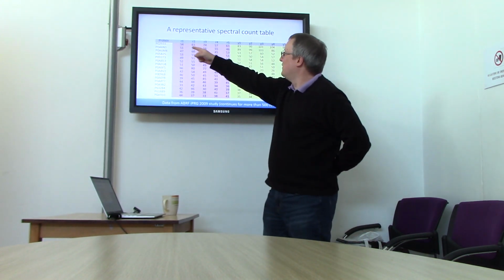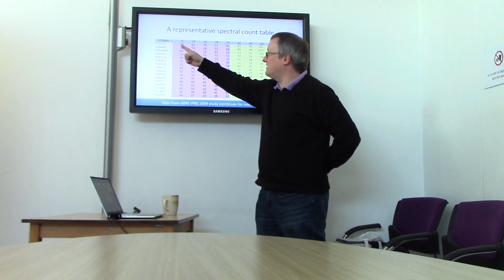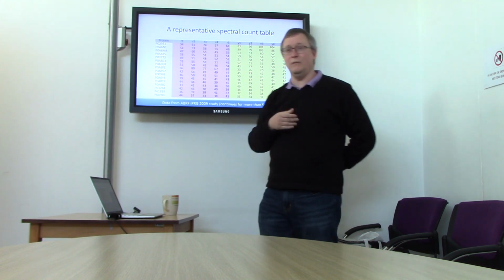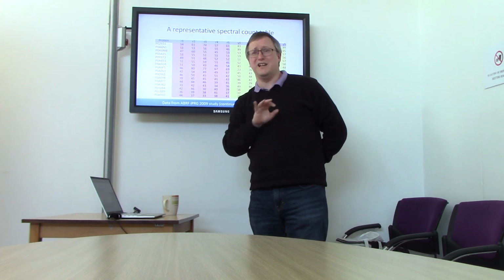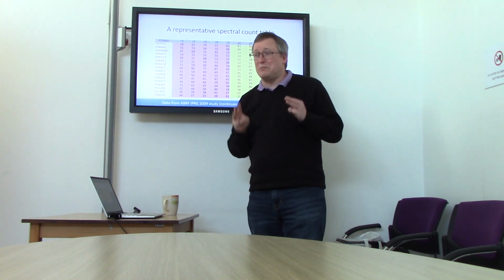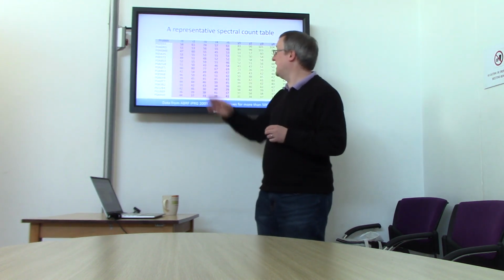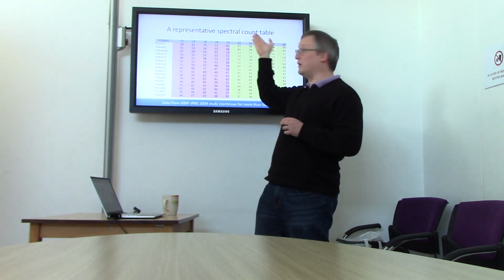All right, so now we have these numbers of spectra, numbers of PSMs, that relate to peptides from this protein in replicate 1 of red, in replicate 2 of red, in replicate 3 of red, and so on. Now, I know a lot of people in biotechnology are very fond of 3-on-3 experiments. You do 3 replicates of red and 3 replicates of yellow. One of the things that I really appreciate about our most common collaborator in mass spectrometry here is that they've really pushed people to start doing 5 replicates rather than 3. And it leads to a better ability to discern which proteins are differential between one cohort and the other.